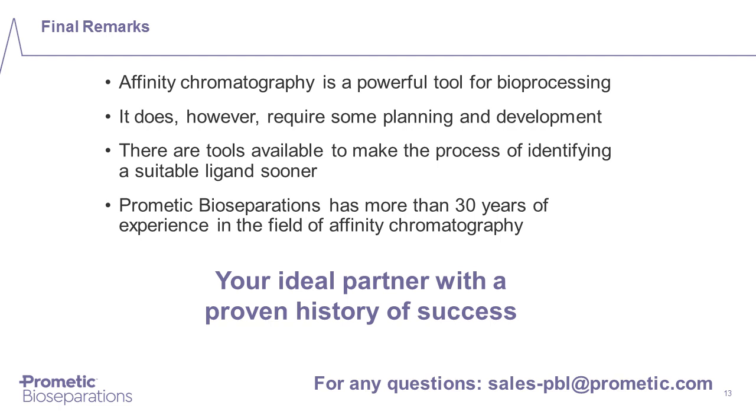Okay. And how do you determine the right matrix for your ligand? So essentially most of the time we test everything. But your process might have some constraints that would prevent using this matrix or that. For instance, you might need to use NaOH to clean your material, which then rules out a few base matrices.